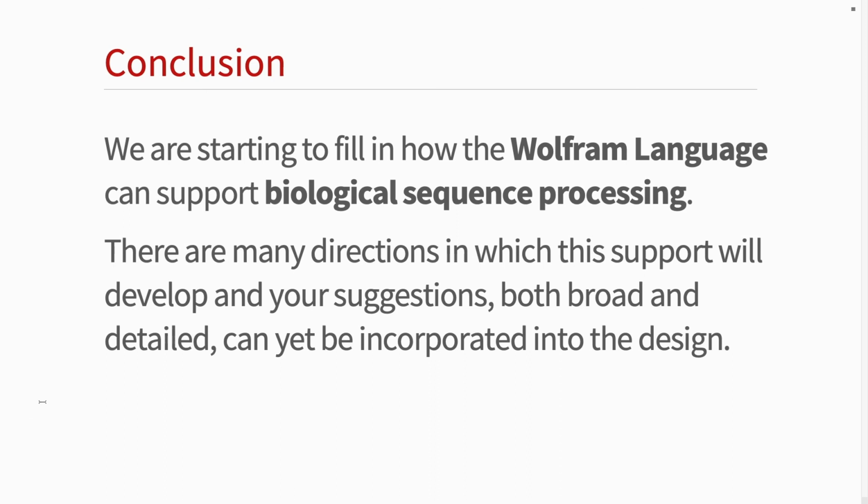So in conclusion, we're really starting to feel how Wolfram Language can support biological sequence processing. And there are many directions, as you've seen, in which this work will develop. And so your suggestions can still be incorporated into our designs.